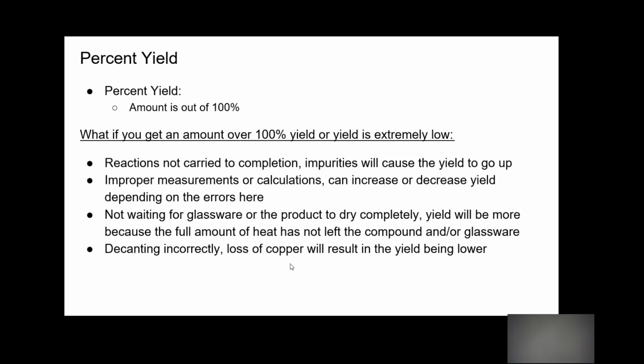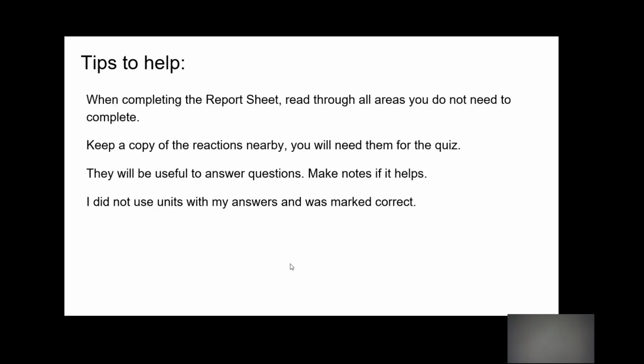Decanting is another important one. We've covered decanting before. So remember when I did, it had to do with filtration processes. Look that up if you don't remember. There's a lot of steps, and we're human. We make errors no matter how careful we are. Things just happen.